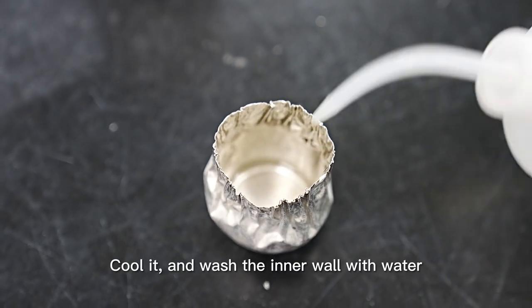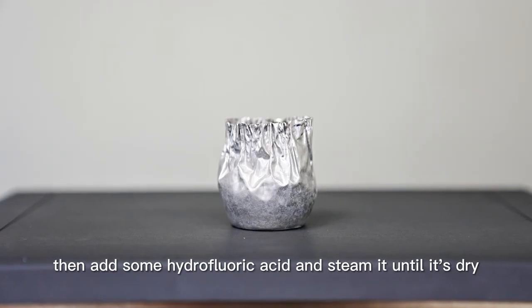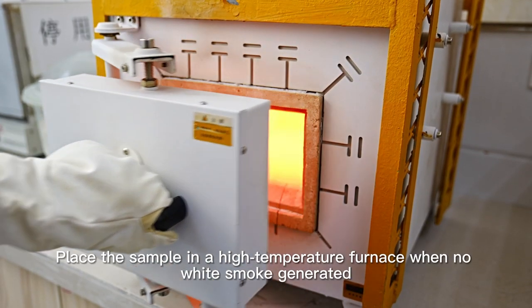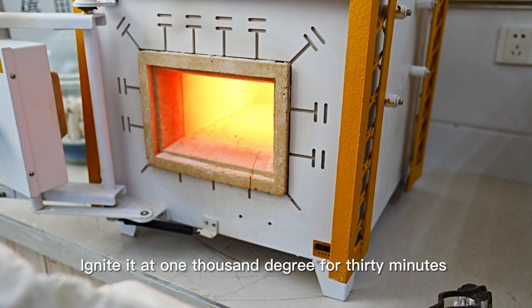Cool it and wash the inner wall with water. Then add some hydrofluoric acid and steam it until it's dry. Place the sample in a high-temperature furnace when no white smoke is generated. Ignite it at 1000 degrees for 30 minutes.